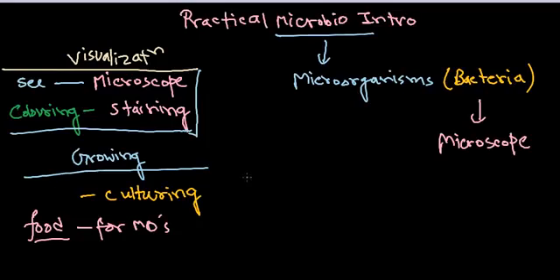So these are the same type, so they can grow on to that food material on the food surface. That's it, right? We need to put a matrix so that they can hold on to it, and second thing, we need to put the food source which contains all the nutrient sources for the growth of microorganism. And it's not a different thing, because the nutrition that microorganisms require is not very much versatile than human being. They are very basic type of organism, they take very basic type of food materials, and we'll be talking about those foods, right?